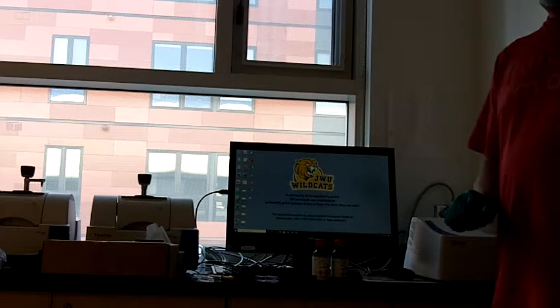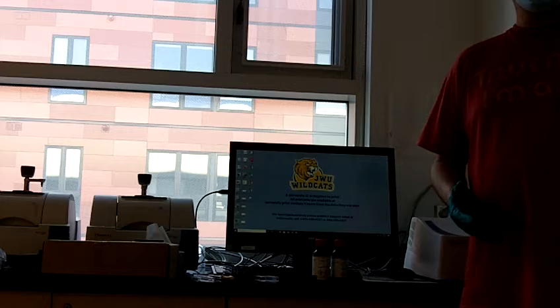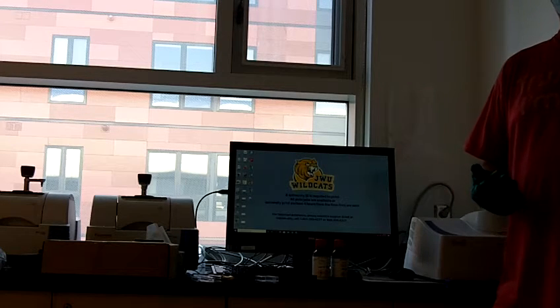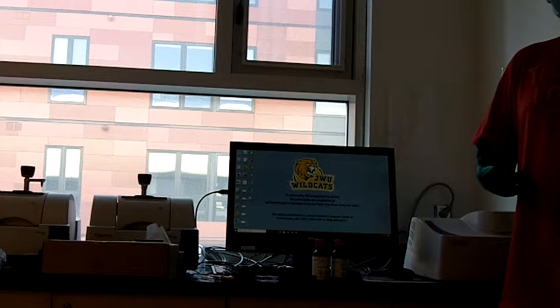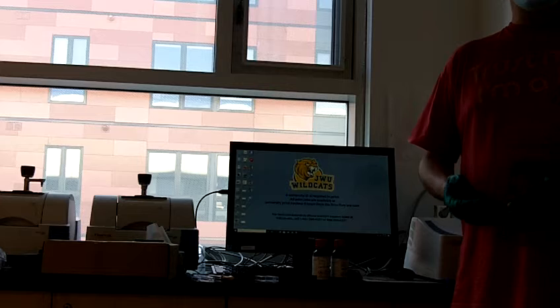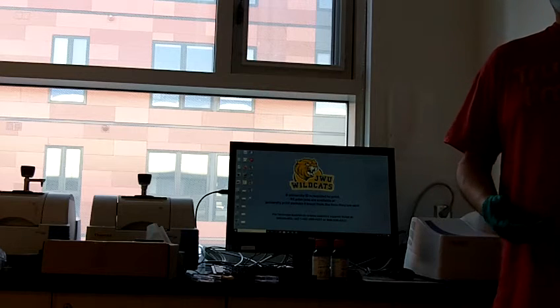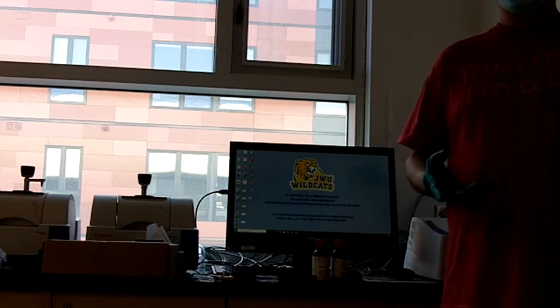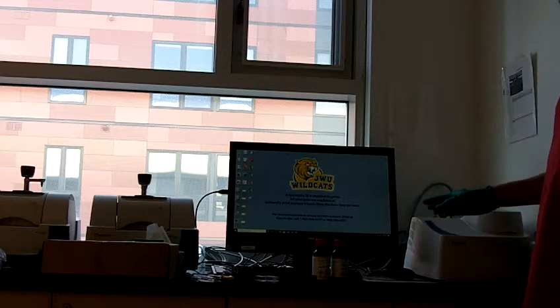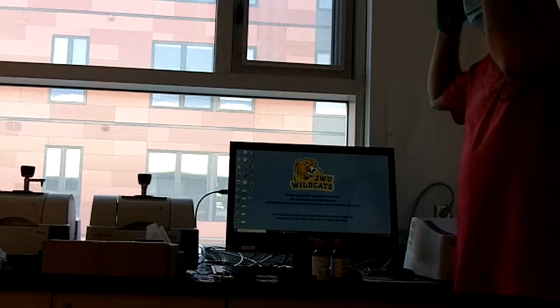Now, we've already gotten some familiarity with ultraviolet spectroscopy in our previous experiment, specifically when we did chromatography. Recall that in the chromatography experiment, if we had a compound that absorbed in the ultraviolet region, we were able to see that on the TLC plate using the UV light. With this instrument, we're getting a more formal measurement of that.